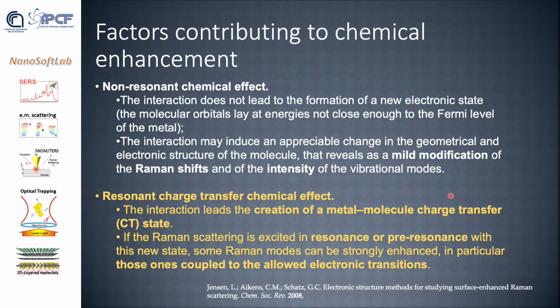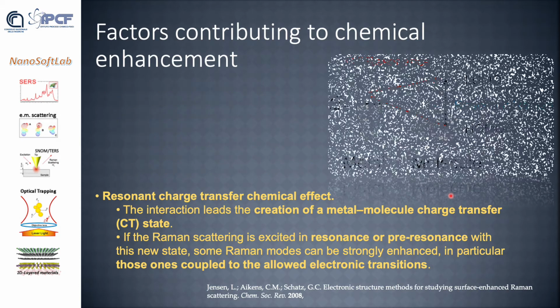On the other hand, there are resonant charge transfer chemical effects, in which the interaction leads to the creation of new metal-molecule charge transfer states, and if the Raman scattering is excited at resonance or pre-resonance with these new states, some Raman modes can be strongly enhanced, in particular those coupled to the allowed electronic transition.